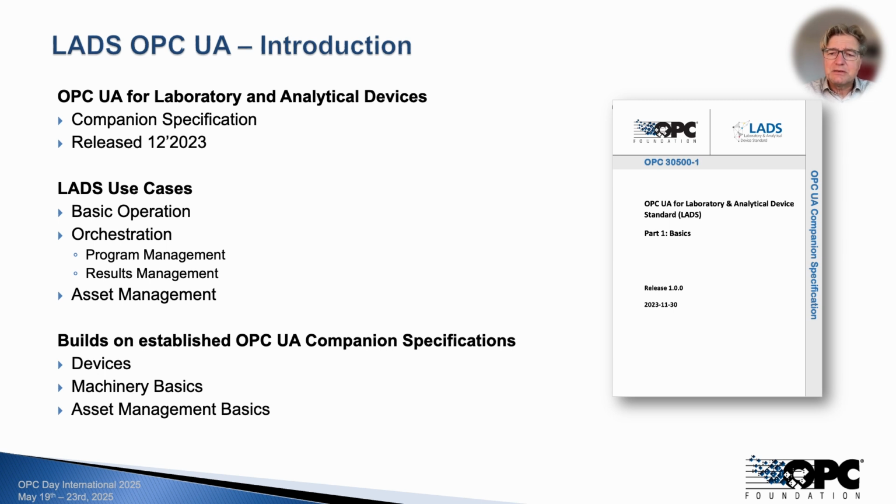LADS addresses the most important use cases of the laboratory and analytical domain. Basic operation, such as reading sensor values and controlling device states. Orchestration, which includes program management, starting, monitoring and stopping predefined workflows. Results management, exposing results in a structured, traceable way. And asset management, covering metadata, identification and lifecycle aspects.